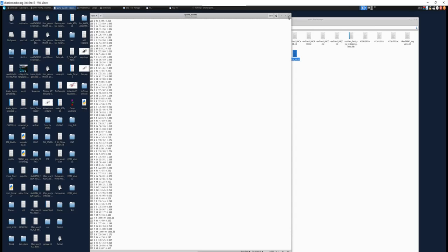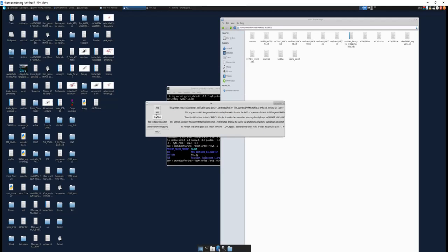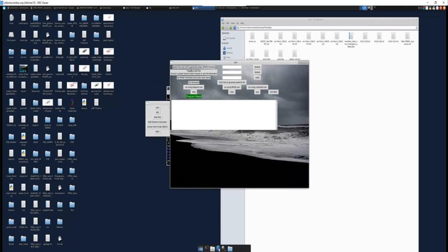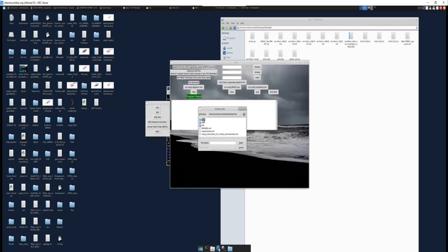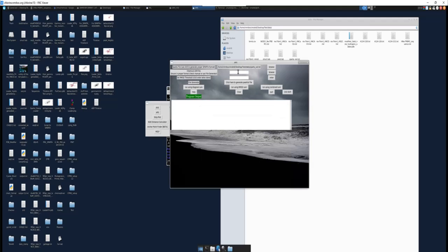So we're going to exit out of this, and we're done using AVS here. So we'll just minimize this for now. And what we want to use now is APS. This is what will be used for your predictions. So you can see the first line here for APS is your Sparta file. This is what you generated with AVS. So what you want to do here is, if I go back to data, we labeled our output file as Sparta_out.txt. So you want to upload that here.